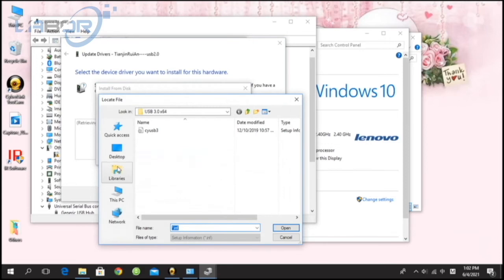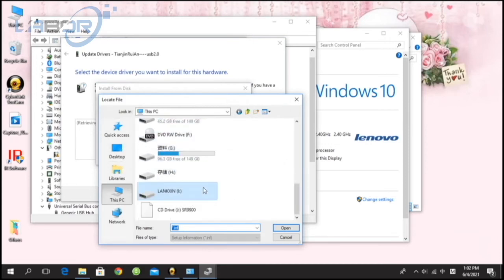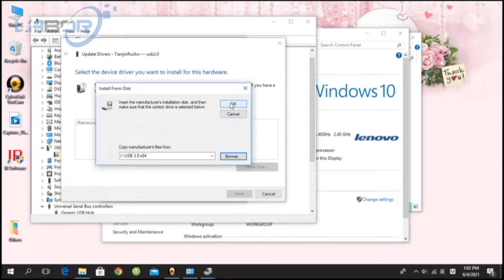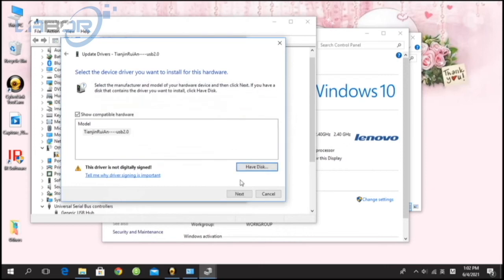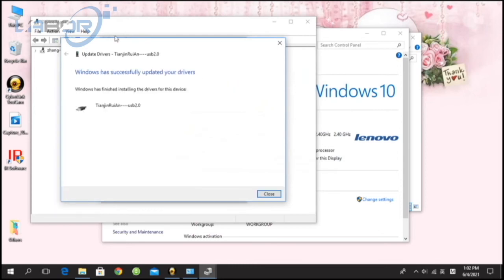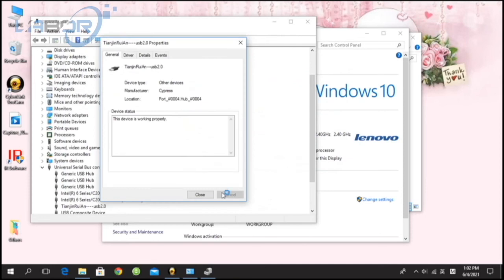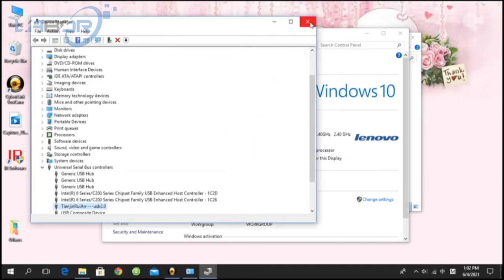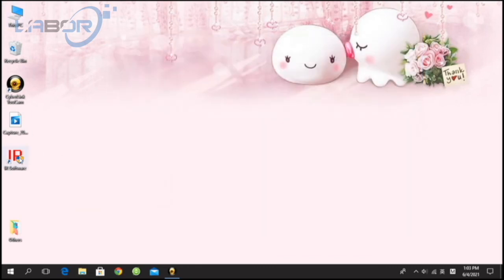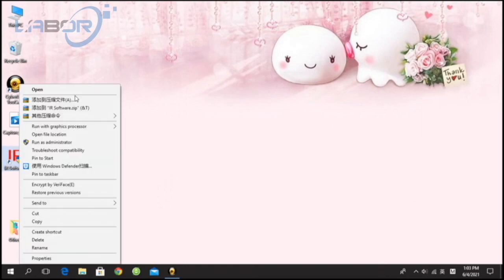If your system is 32 bits, please choose USB2. If your system is 64 bits, please choose USB3. My system is 64 bits, so we choose USB3. Okay, installation finished.